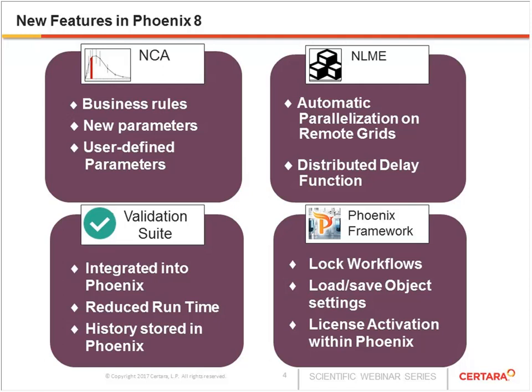And then finally, one of the most exciting enhancements is the ability to add user-defined parameters for non-compartmental analysis. This includes both computed concentrations using the interpolation method, as well as defining other parameters that may not be standard. For example, maybe you need a half Cmax value for some reason. You can actually define that, and it will automatically calculate it and include it in the output for you when you run your NCA object. Again, the objective is to minimize the post-processing work that you might need to do to generate the required output.